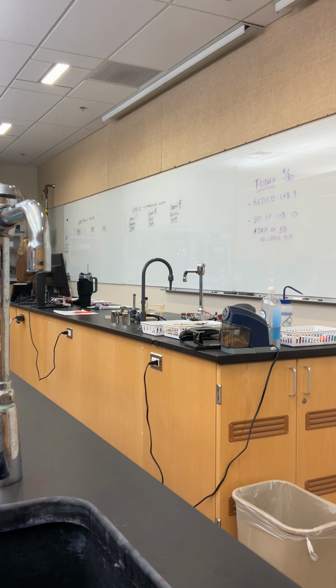Because it is a general growth medium. So again, what that means is it has all of the nutrients it needs to grow, nothing to select or inhibit. So that's going to be our nutrient agar. So let's start by looking at mannitol salt agar, which is going to be the pink color plate.